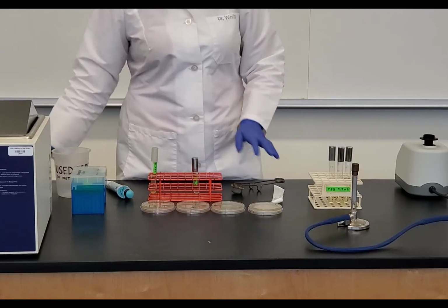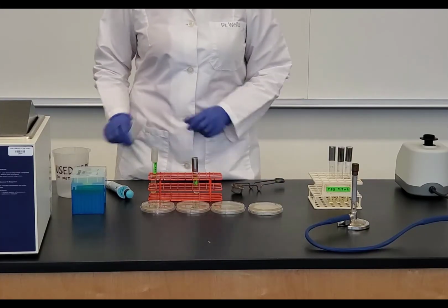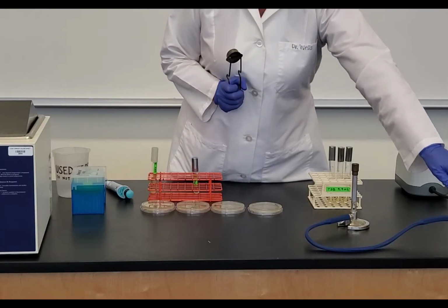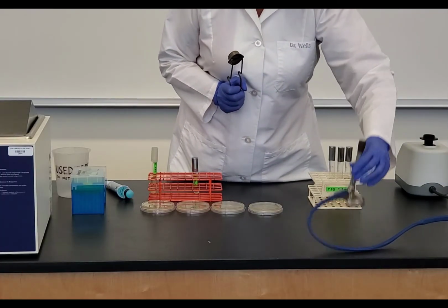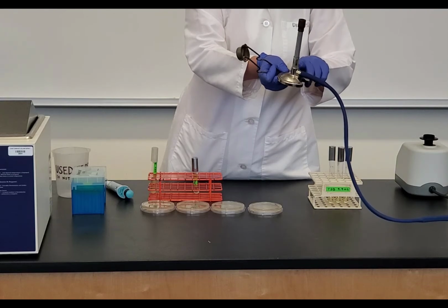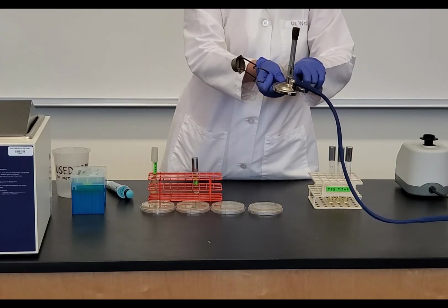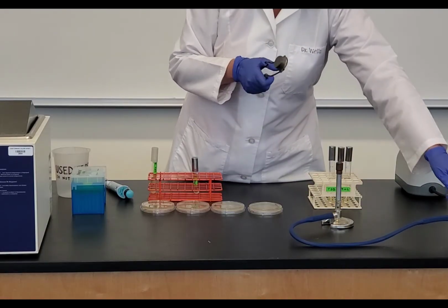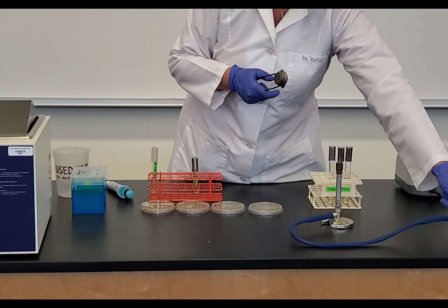So I've labeled all of the supplies that I need, and I'm going to start by turning on my Bunsen burner. So I need to turn on my gas. Remember, the way that I do that is I like to start with my baffle being open, and that allows the air to go through. So I start with the baffle open. I turn on the gas until I hear a hissing sound.